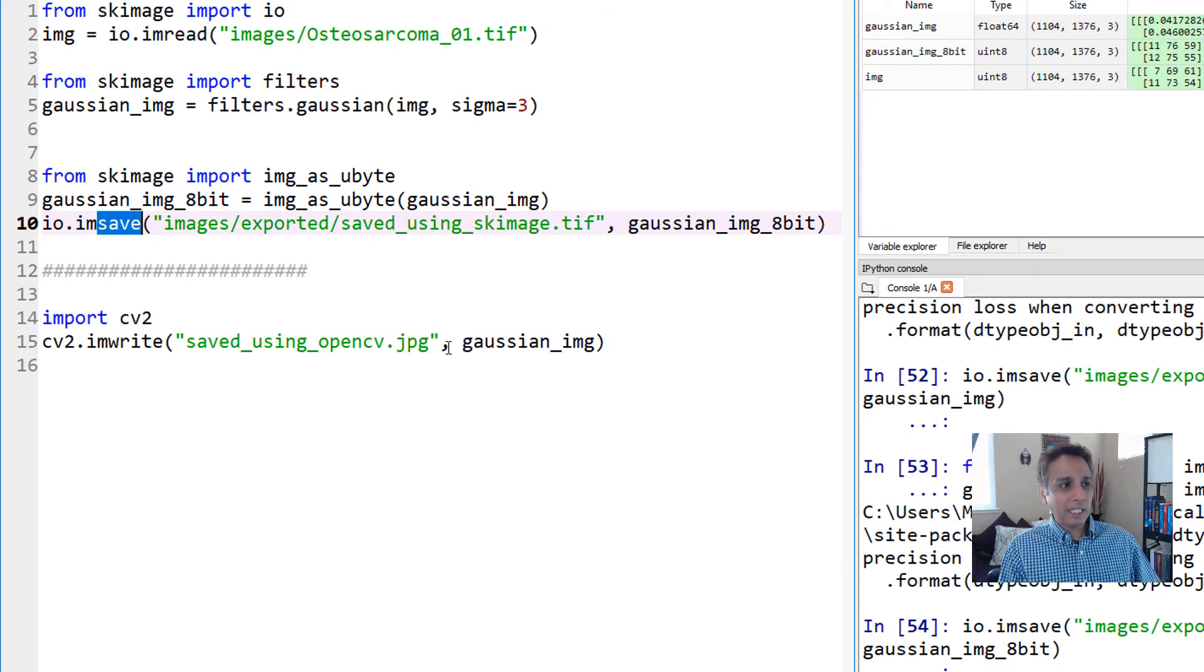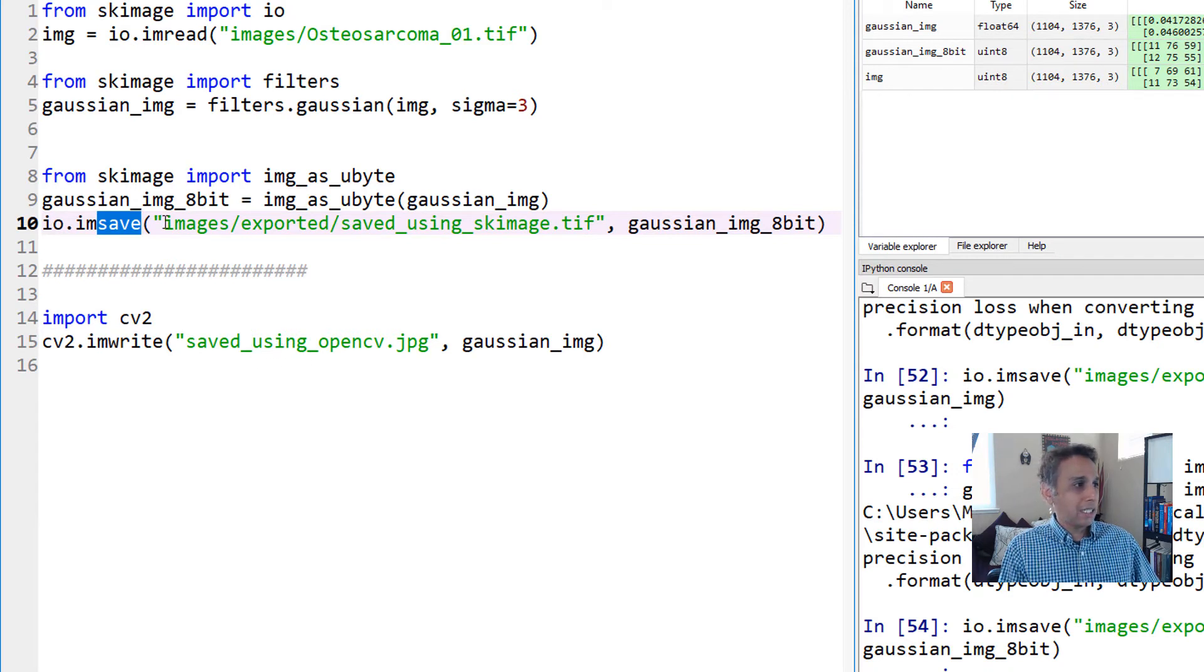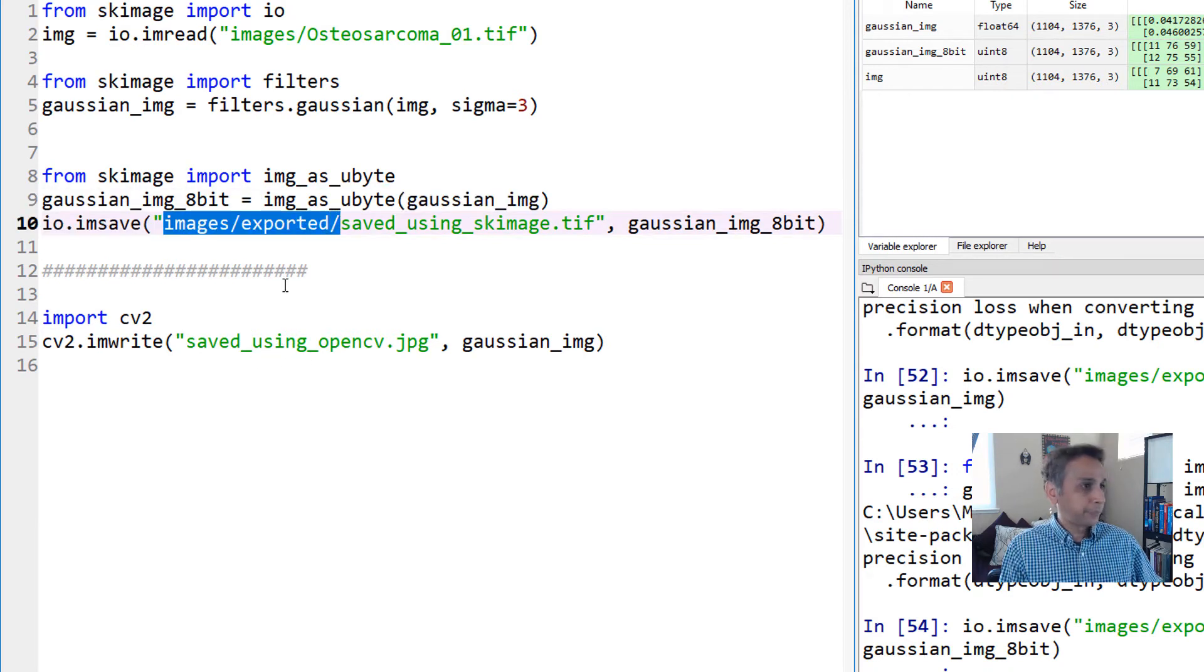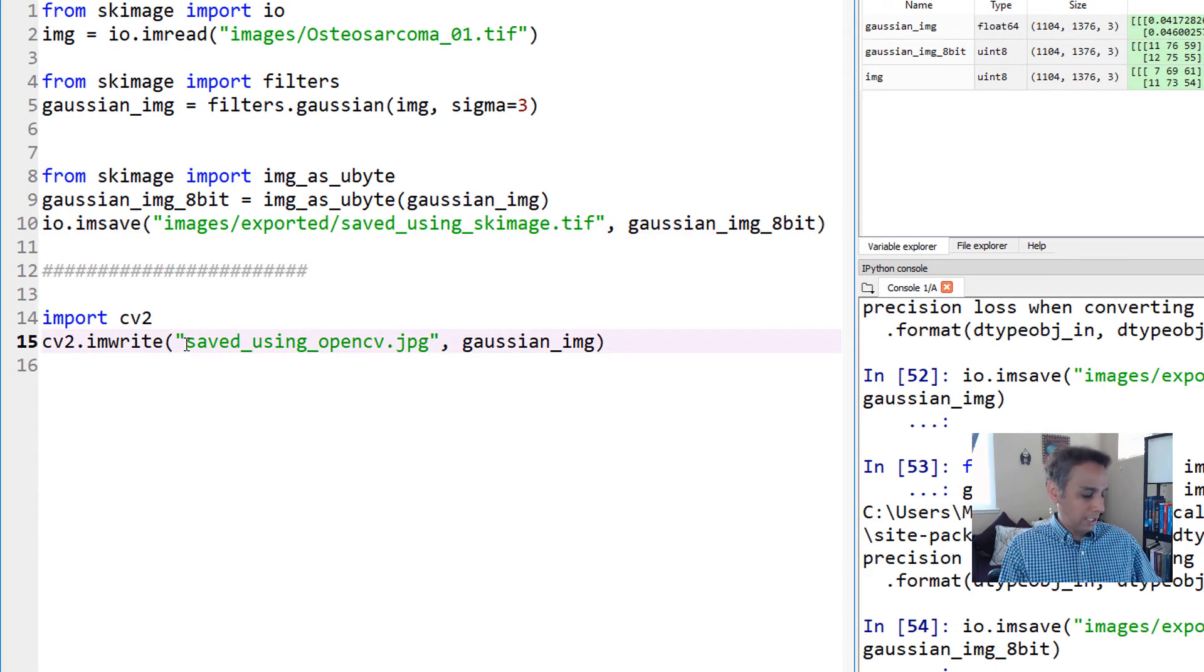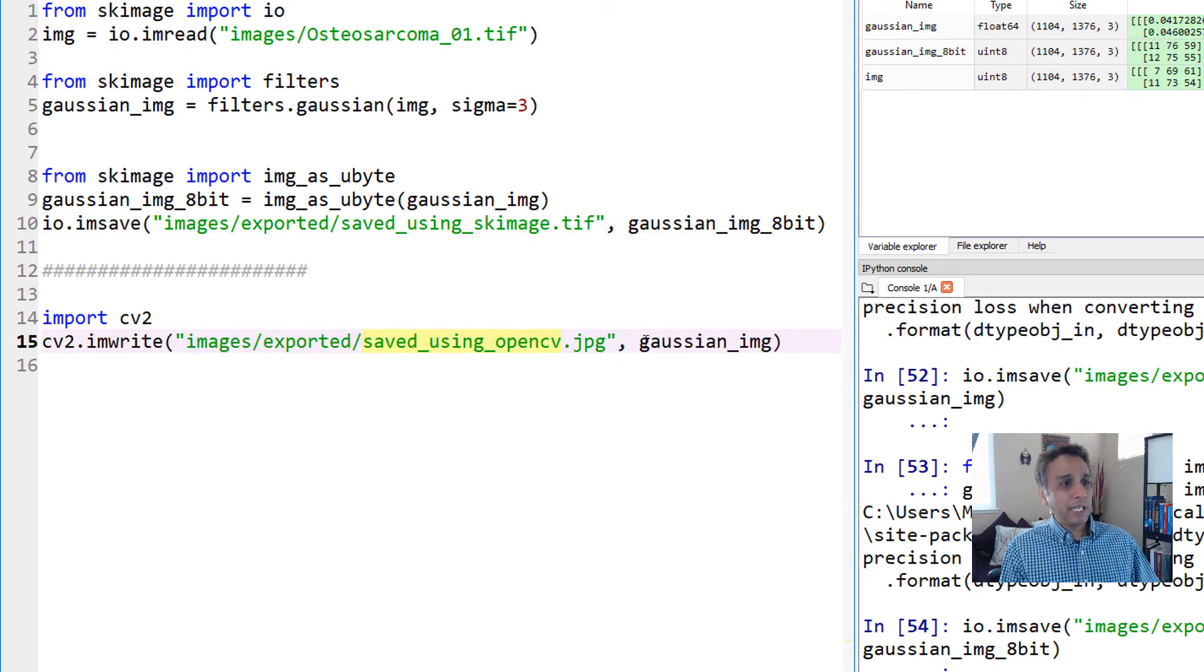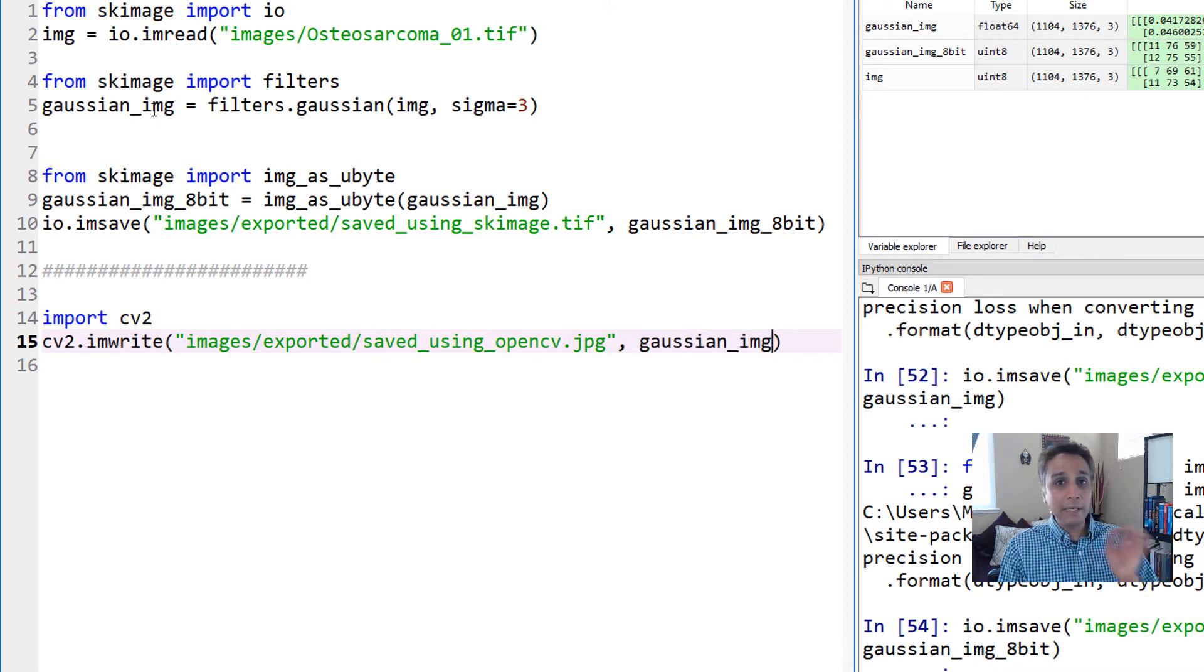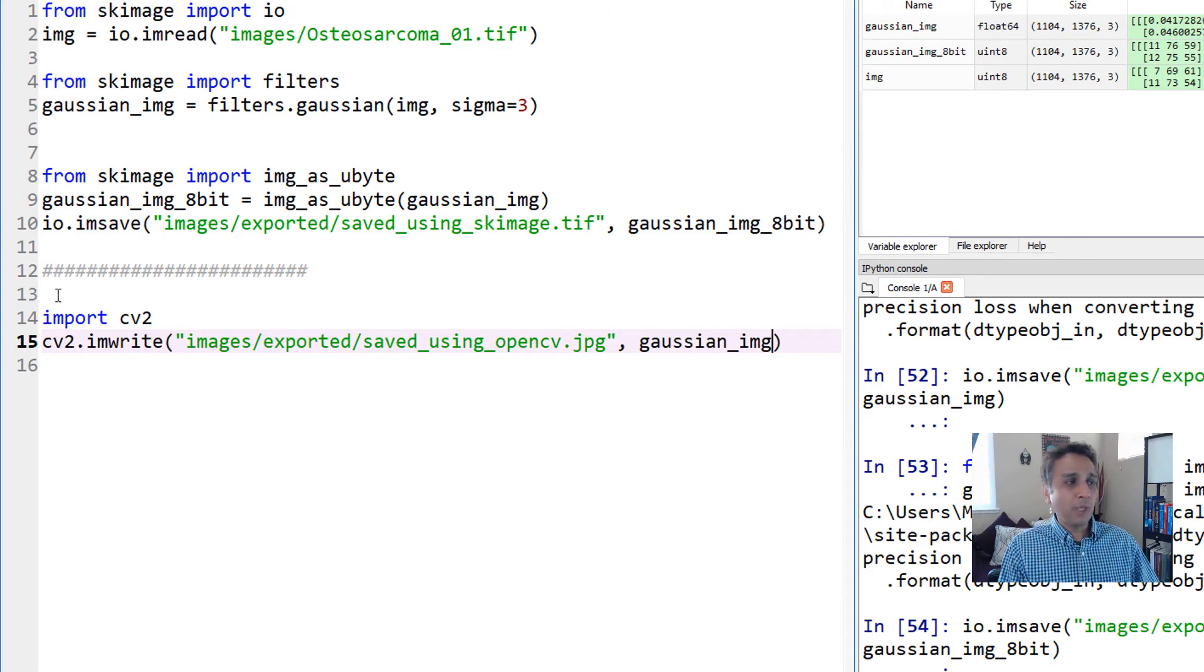This is the filename, and I'm saving gaussian_img, which is our floating point image, not the 8-bit. I'm doing this just to see what happens.